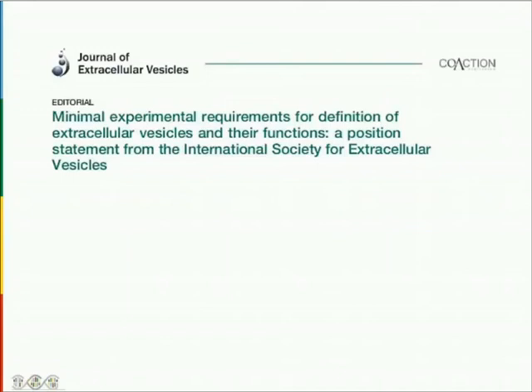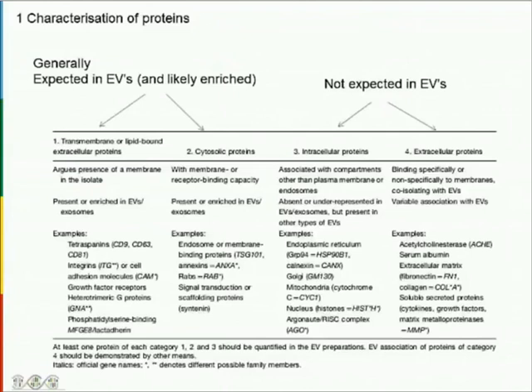Firstly, when you have an exosome preparation, you need to look at the protein repertoire in your sample. Classically, in my lab and in many other labs, we would look for some tetraspanin proteins present, such as CD9, CD63, CD81, perhaps some markers related to the endocytic tract, such as TSG101 or ALIX, for example. And that's where many groups would stop. However, ISEV are advising people not to do that, but also look for things that they should not expect to see in their sample. The Golgi, mitochondria, the nucleus, these are compartments of the cell which are not particularly well represented in exosome vesicles. So if you stain for some markers of Golgi or mitochondria, you should probably not see abundant bands on your westerns for these components.